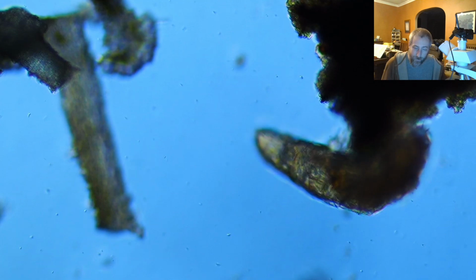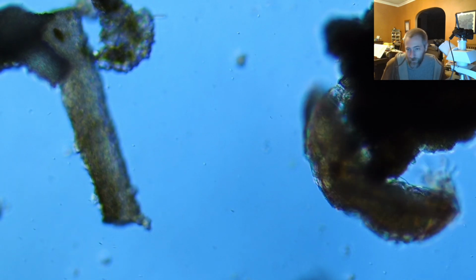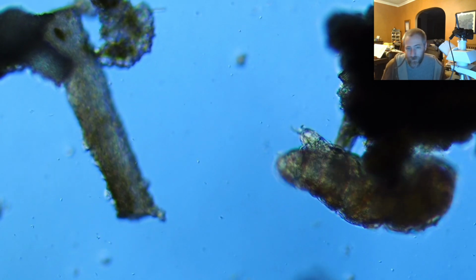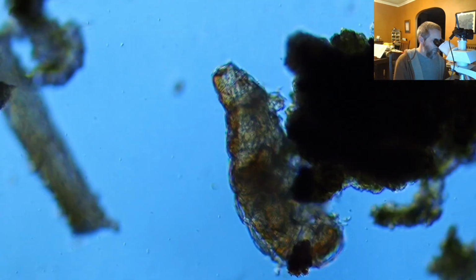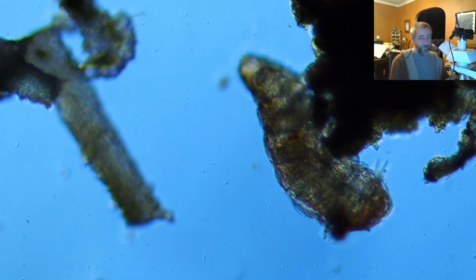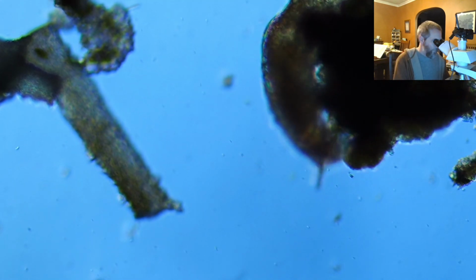You could look at them genetically and see how different they are genetically from one another. Or you can just look at their body structure. And if you Google water bear SEM, there's all kinds of different water bears that you can find just from looking at things that have been imaged already, on an SEM or on a light microscope. The characteristics that set one species from another, because they don't look like they have very many characteristics, I'm guessing it's partly size and body shape. Like this is a big guy right here compared to that other one that's just a little ways away over here, which is really quite small by comparison.